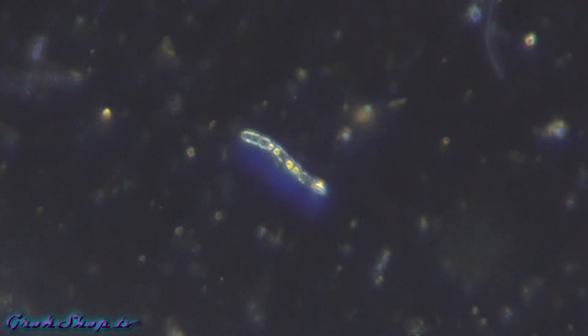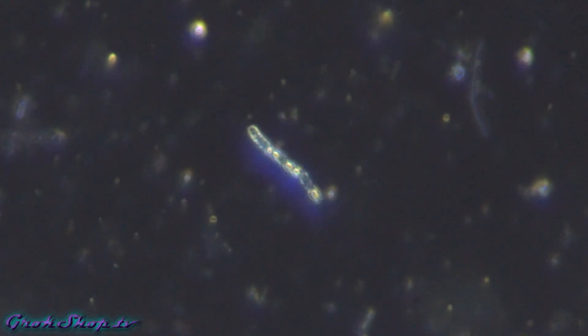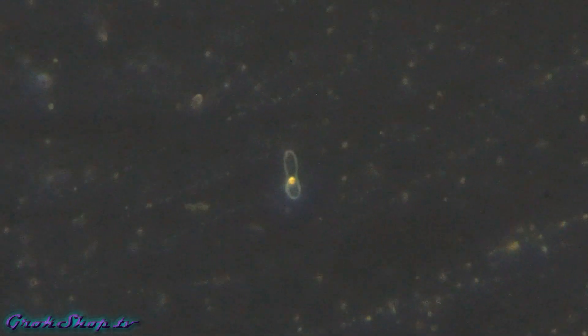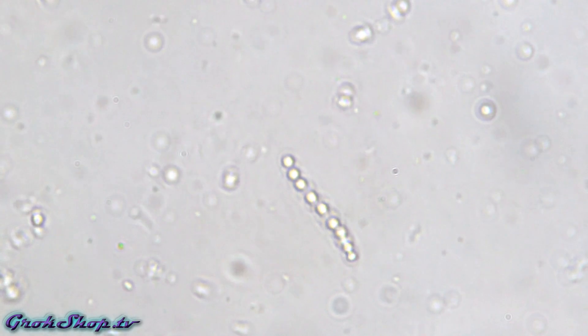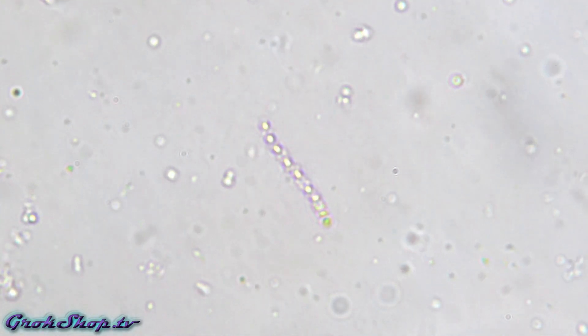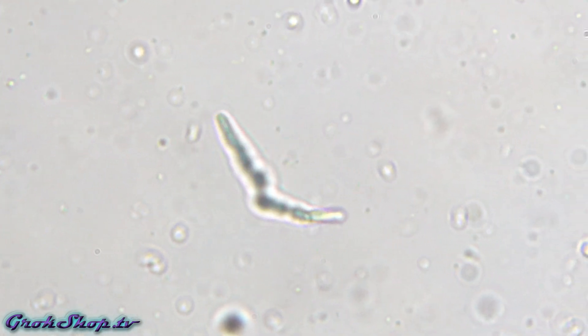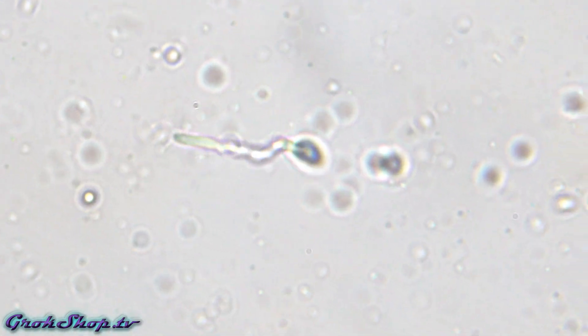Looks like we've got a little flagellate here, and some bacteria swimming along with it. Nice serene strand of sausage-link bacteria floating along here. Some bacteria is motile — it can move on its own power — and other bacteria is non-motile. Here we have some very much motile bacteria.